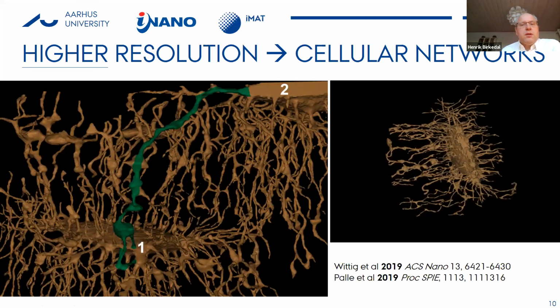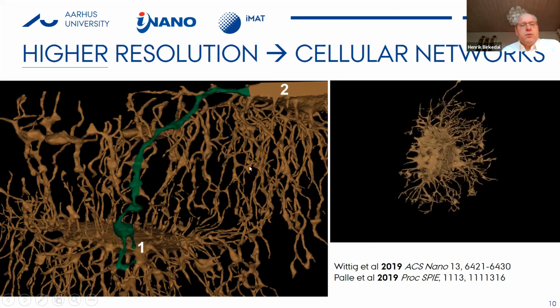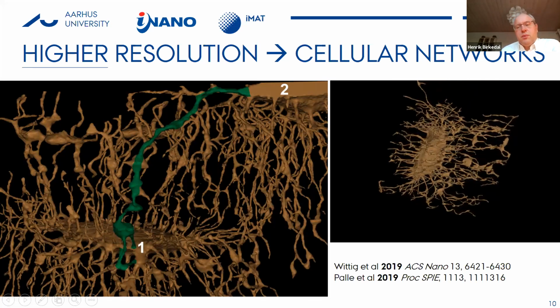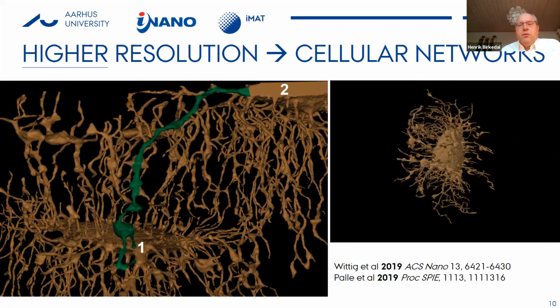So what you can see here on the left are two cells from a large volume. Here is an osteocyte lacuna in number 1 and number 2, and you can really see they're interconnected by this vast network that also Peter alluded to in his talk. Now, having these data in 3D allowed us really to see many new features.